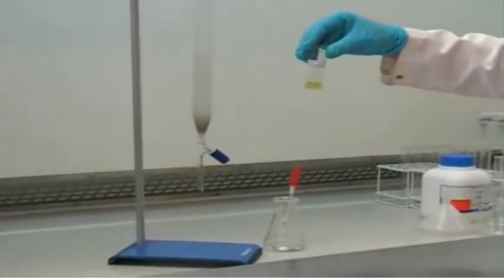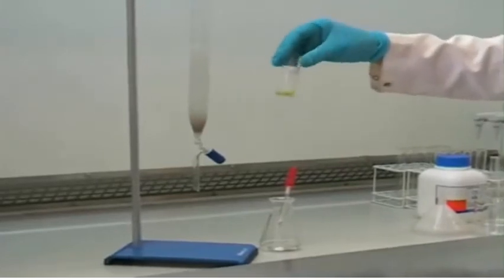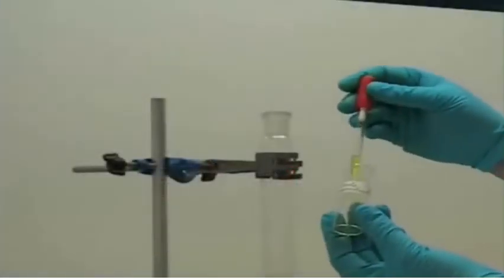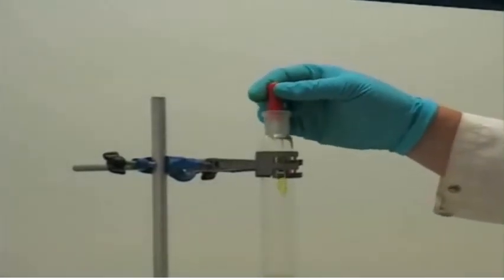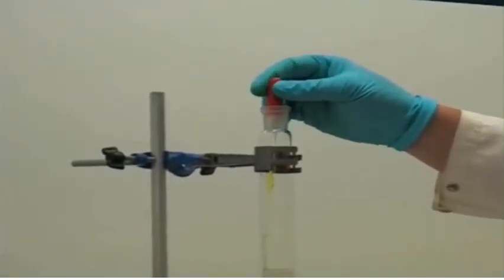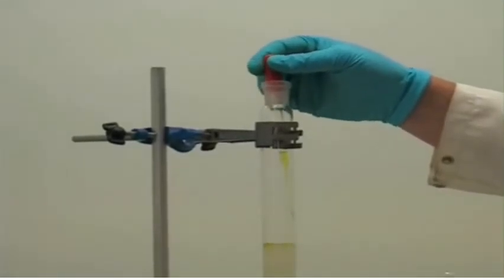It's important to ensure that all of the crude compound has been dissolved. And then the resulting solution can be added to the column using a glass pipette. Here you can see the solution is being added evenly around the sides of the column.